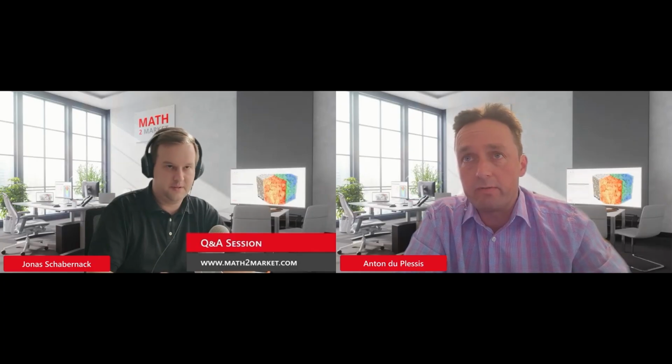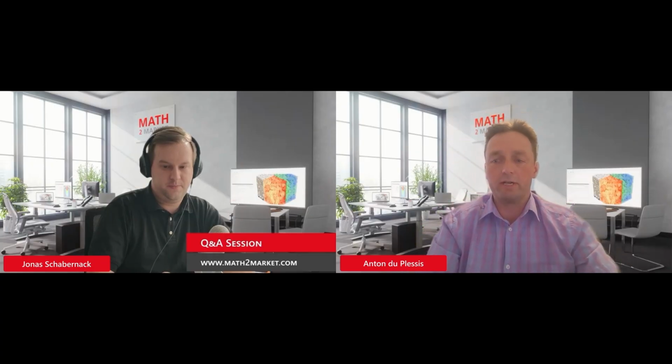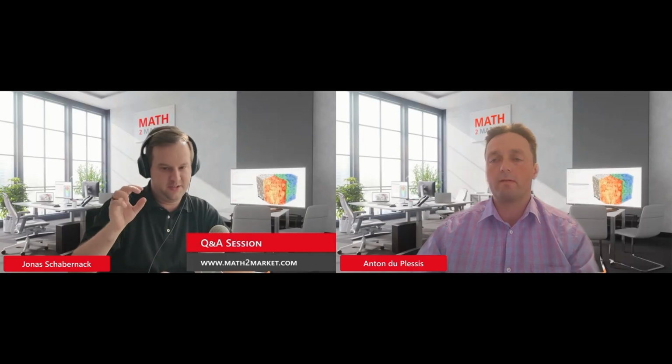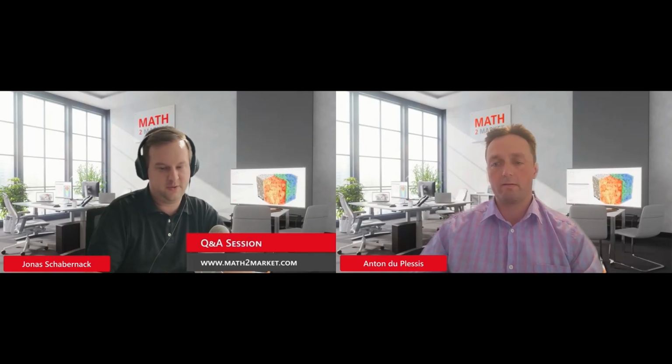Yeah. But you need to separate them first as a first step, and for that, the FiberFind module is used. We have normal image processing separation methods, and also an AI method with a pre-trained AI model, which helps with that separation. And then you apply after that the contact resistance. So good question. Thanks for that. I think in that sense, the FiberFind module is quite similar to what we do with the identify pores. In the end, you also get individual fibers, and all of them have individual properties and so on. So it's quite similar to what we've seen today, just not on pores, but on fibers.